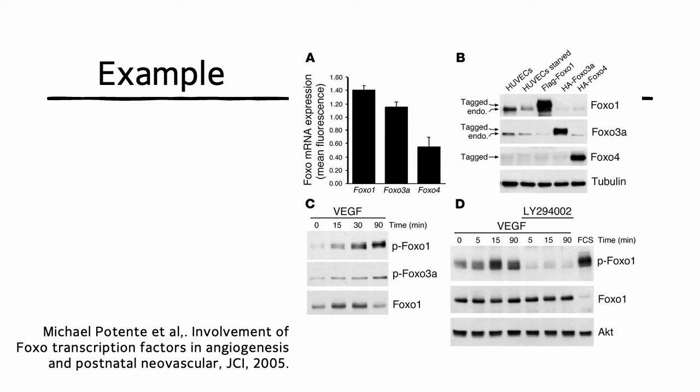In that case, since the protein has a tag, it's a little bit heavier than the endogenous protein made. So that's what it says. We are gonna go over what this site means after we go over the procedure of Western blot.